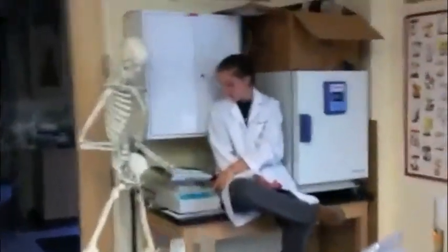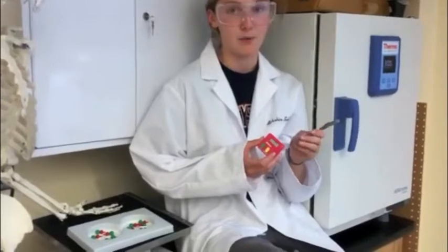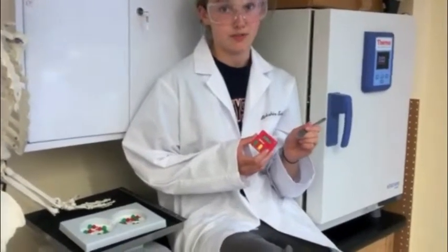Once you have reached the desired elevation and orientation, record the termites' movements every 30 seconds for 10 minutes. Make sure that you are writing all of this down because it will be very important when discussing your results section.